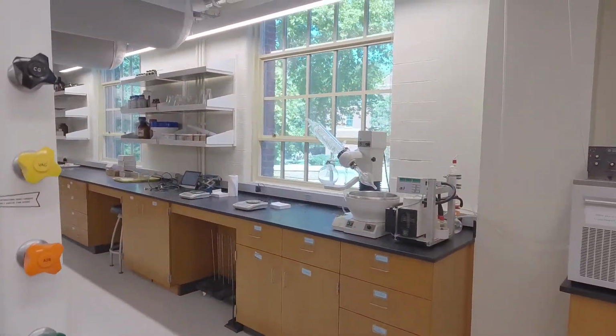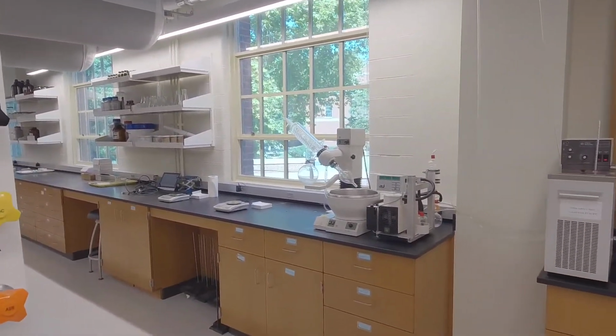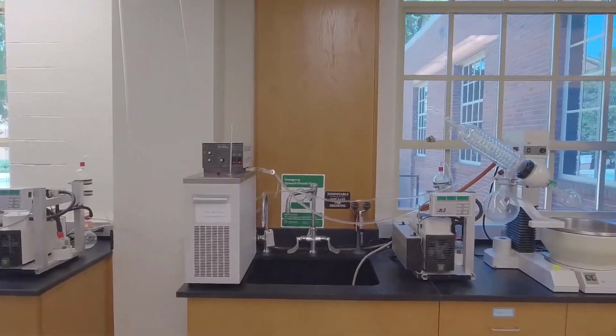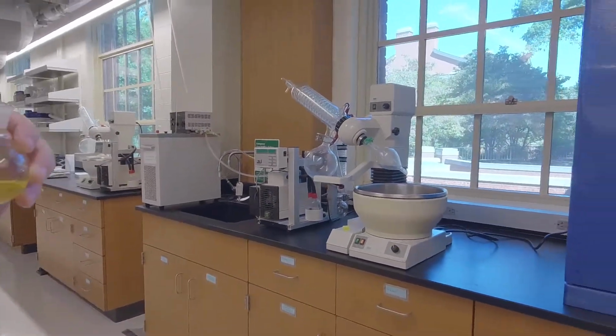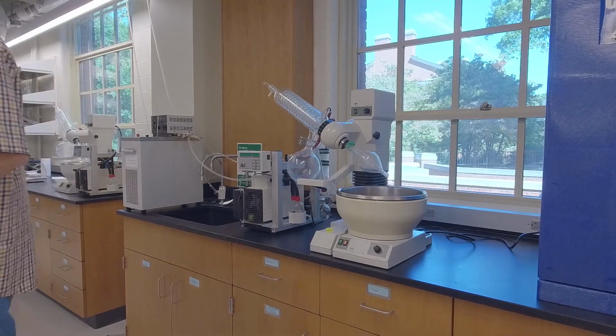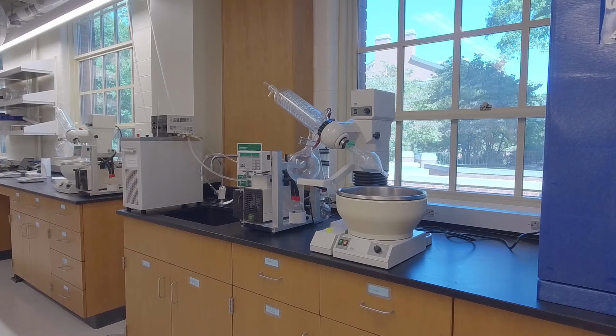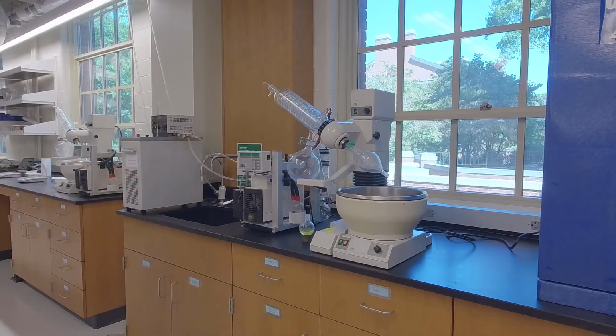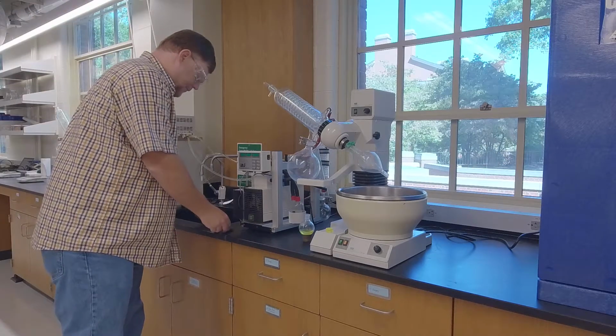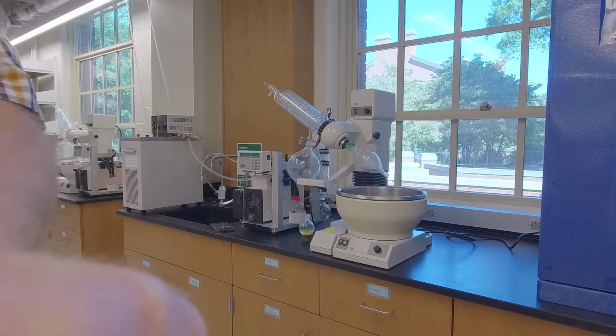All right, you can see out, look, there's some folks walking along, prospective students. There's a rotovap. Here's the rotovap I've gotten keyed up. So this is the window nearest the door. All right, I'll be right there. You guys probably shouldn't do this. I just need to get my phone and stuff, so I'm going to set the flask there. All right, am I on camera is the question. The answer is yes, I am on camera.